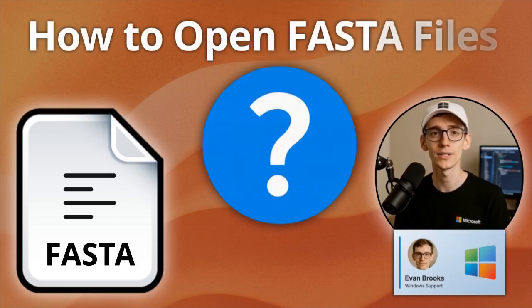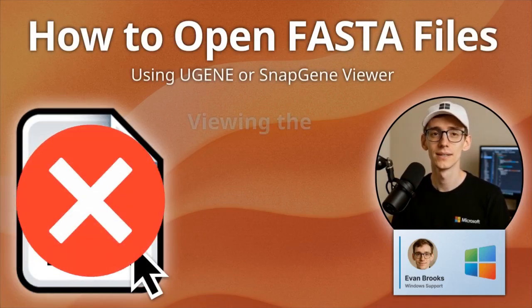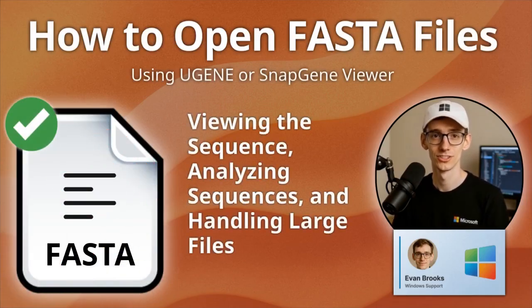This is a FASTA file. It stores nucleotide sequences. It's basically a text file with a standard header. You can open it in Notepad, but biosoftware makes it readable.